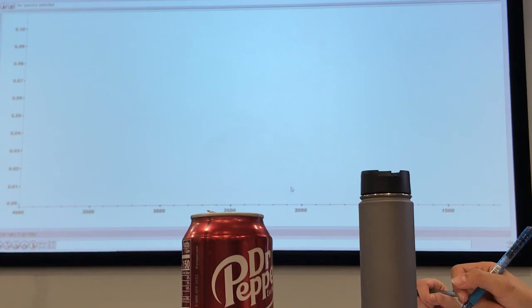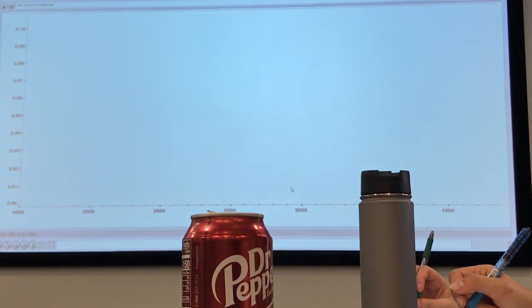This runs in the background for the other software, but this is exactly the way it's going to run. The other reason I want you to get more used to this is also later on, if you are coming back to run your sample when the study starts, in a couple of months, I think, you may wonder, how do I create my own library, or how do I do this, how do I do that? There are videos that will walk you through everything: how to create a library, how to do a search, and everything like that. Not that I'm saying don't listen, but if you get stuck at any point, there is no problem. Just go to our website, and there are videos for everything, including how to collect a spectrum. There are little videos that will walk you through the process.